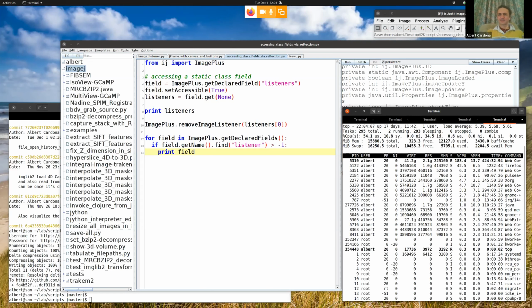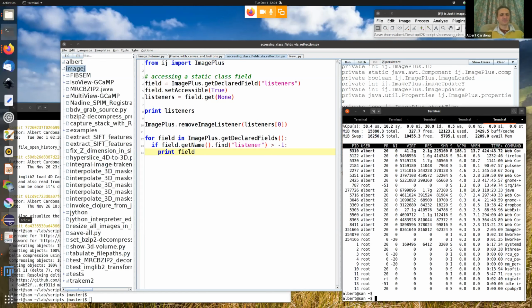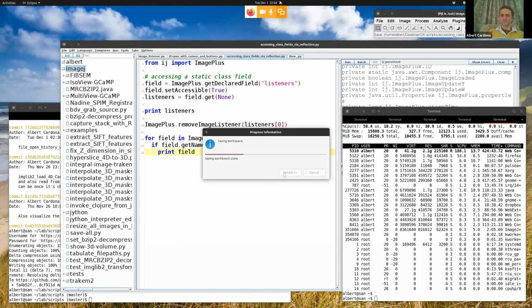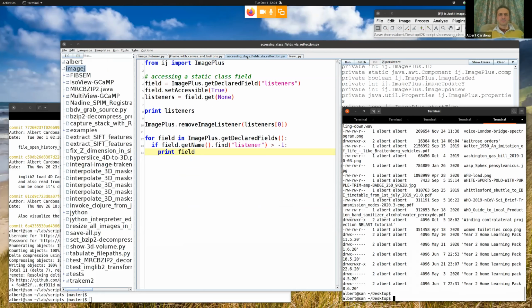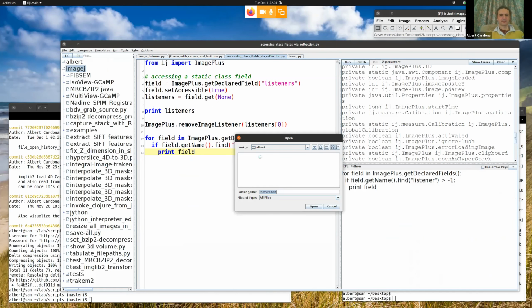I suspect there's an enormous amount of small files being created somewhere. Oh, come on. By who? I'm sure it's not this. Now it works. Okay. Sorry, I wanted to add, so there's this feature here where you can add buttons, except it doesn't.